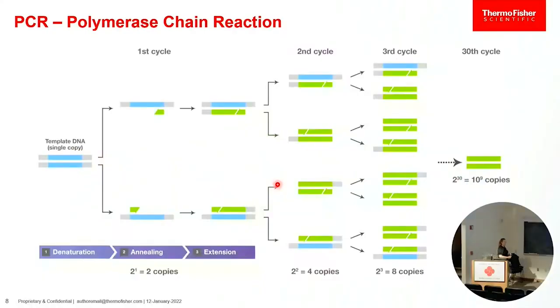If you imagine what's actually going on in the reaction, so we can go through one process and build once. We copied once. The beauty of this with our enzyme and this temperature control is we can do that over and over. So what we do is after our first copying session, we had double-stranded DNA.